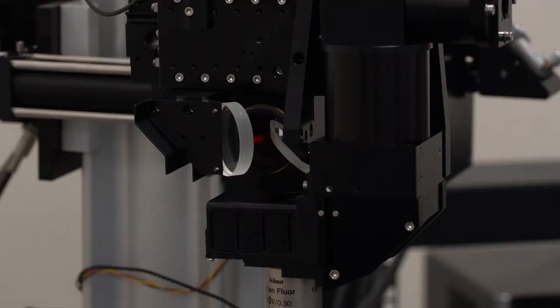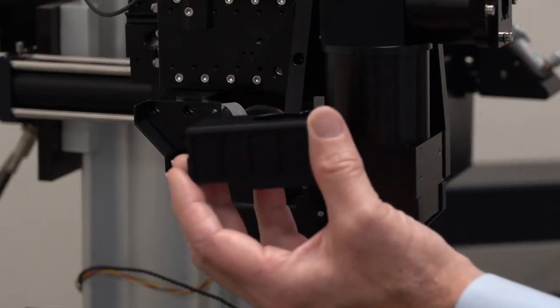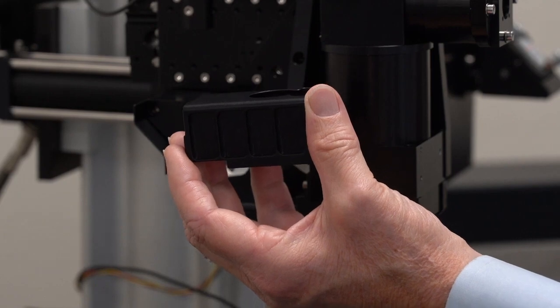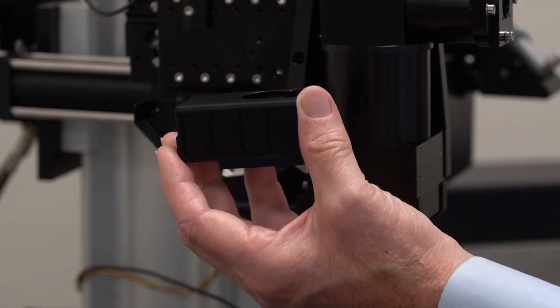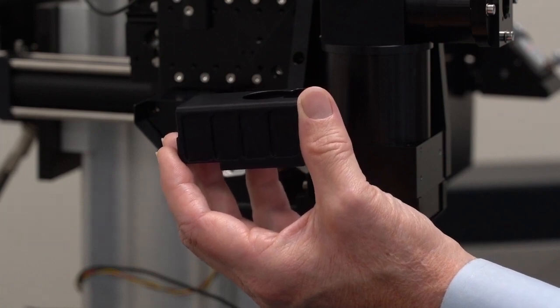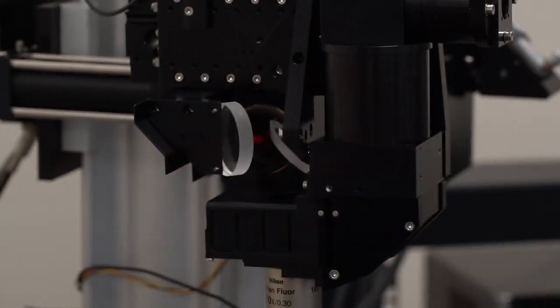So now, the new features. This is a light blocking cover that keeps ambient light and visual stimuli from getting to the sensitive PMTs in the detector path. We've installed these on new scopes for several labs in the last year and also sent them to existing customers who've purchased MOMs in the past.